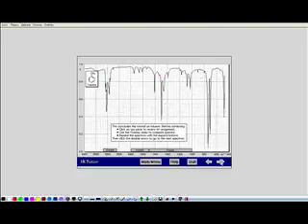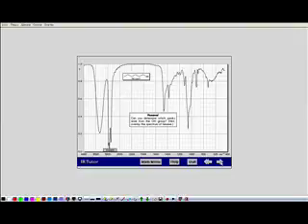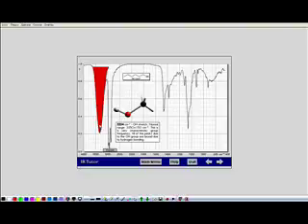All right, we only got a couple left. Alcohols. The big characteristic alcohol is the OH stretch that occurs at 3,300 to 3,400 to 3,500 wave numbers. Now we saw water, its OH stretch was about there as well. It turns out that it doesn't matter what the alcohol is. It could be methanol, it could be a 100 carbon chain with an OH on it. That OH is always in that 3,400 to 3,600 region. And that's the beauty of infrared. Infrared is not specific to individual structures. In other words, an alcohol shows up in the same place regardless of the rest of the structure.